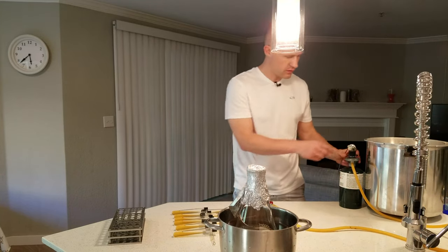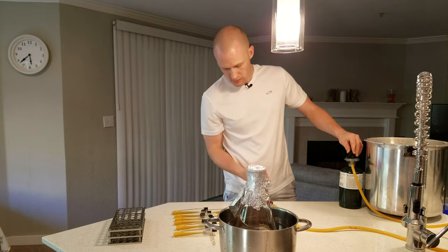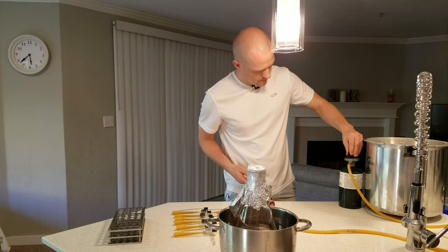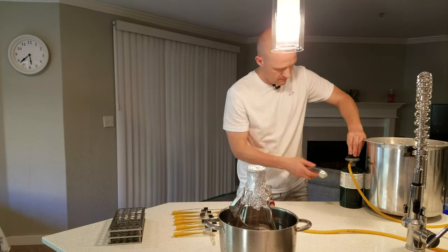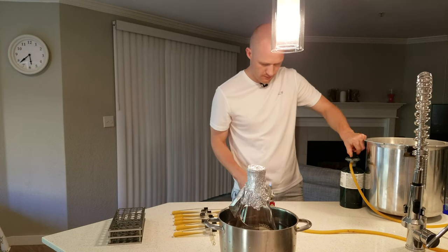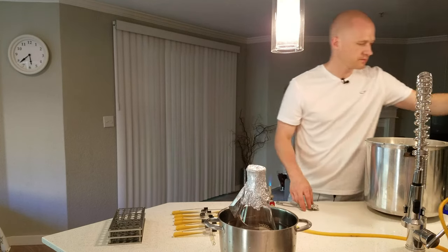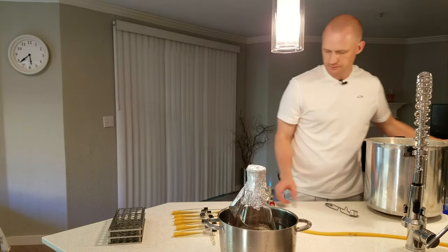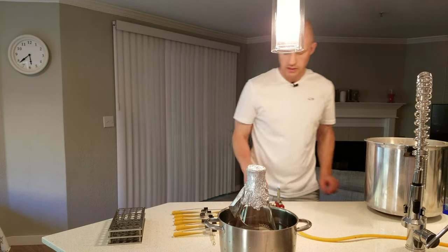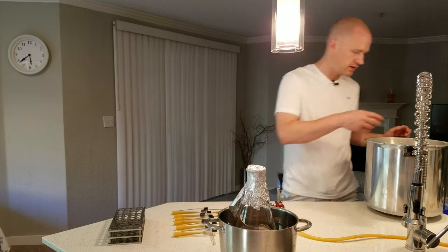So what we'll do is turn it on. Now the air around here just goes up like this, so nothing will fall into the area that we work in.